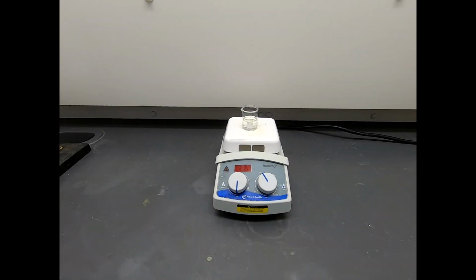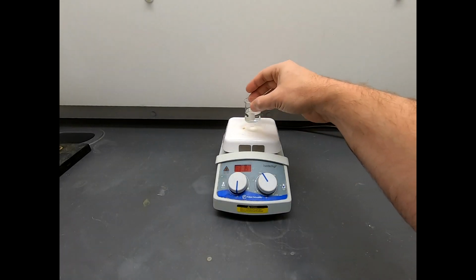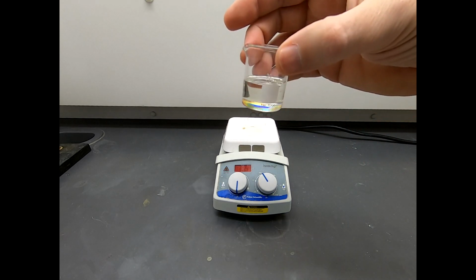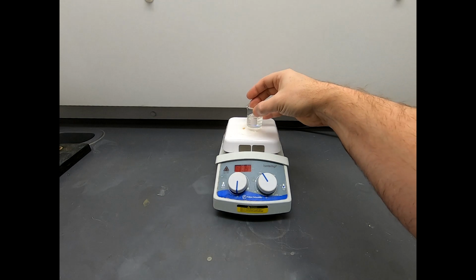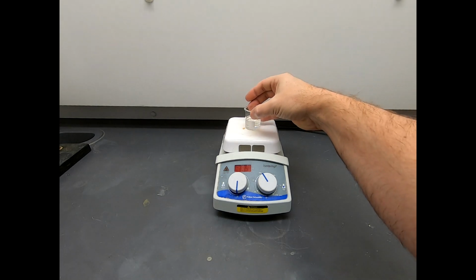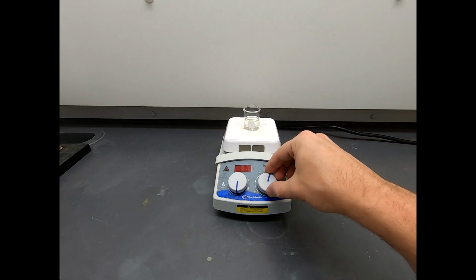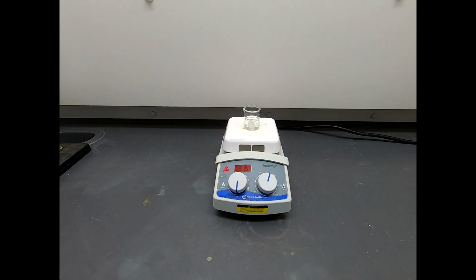Okay, we're now in the hood. Our same 20 milliliter beaker has this liquid in it. I'm going to say it's about 12 milliliters of liquid. I have a very small stir bar in there. It is stirring. We'll stir it a little faster. Now, this reaction does not have any solvent. It's a neat reaction. And before we get it started, we need to add our amine.